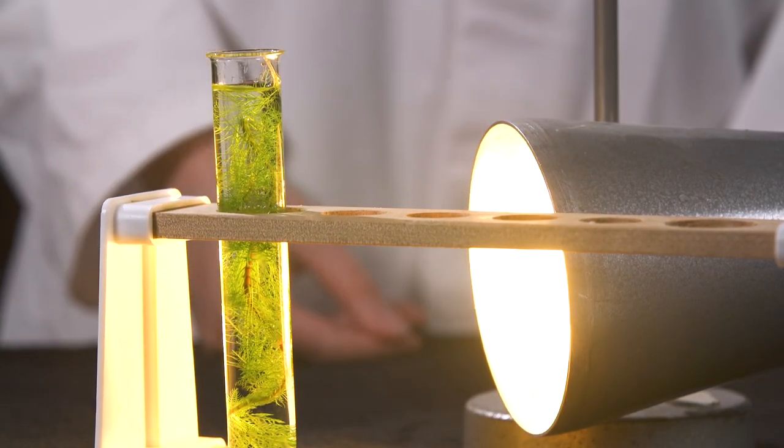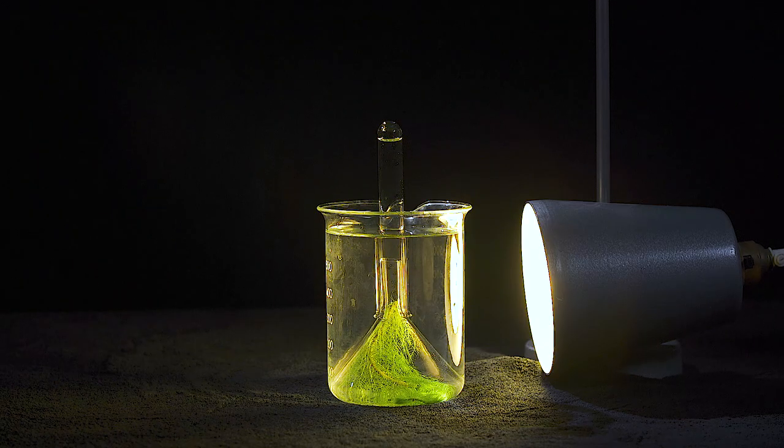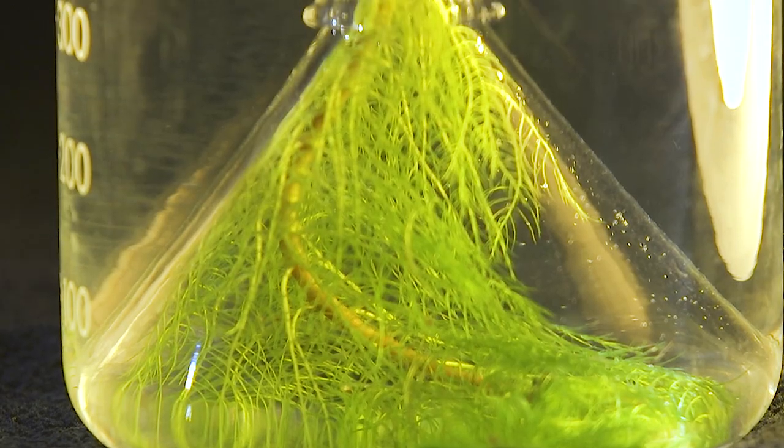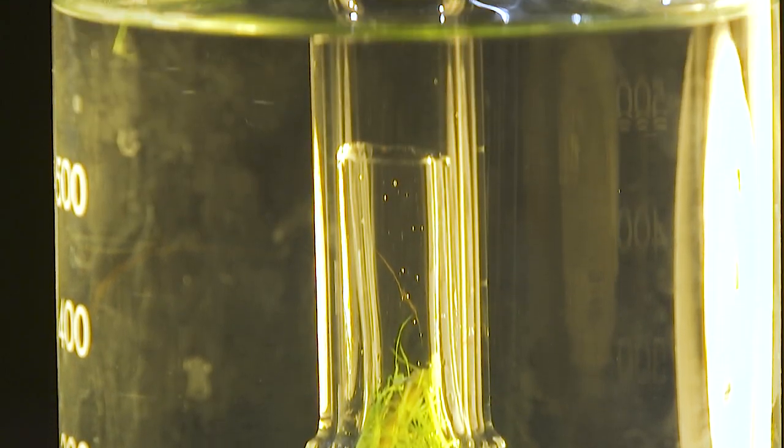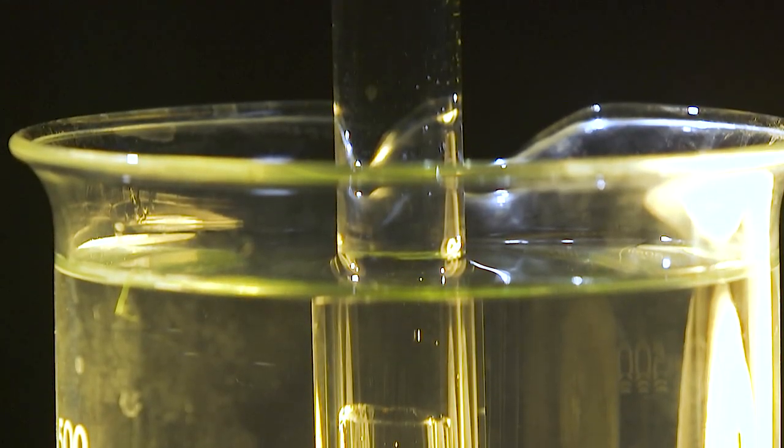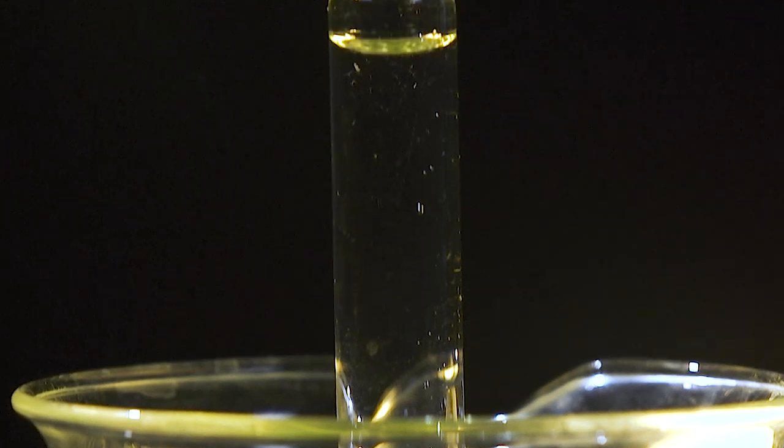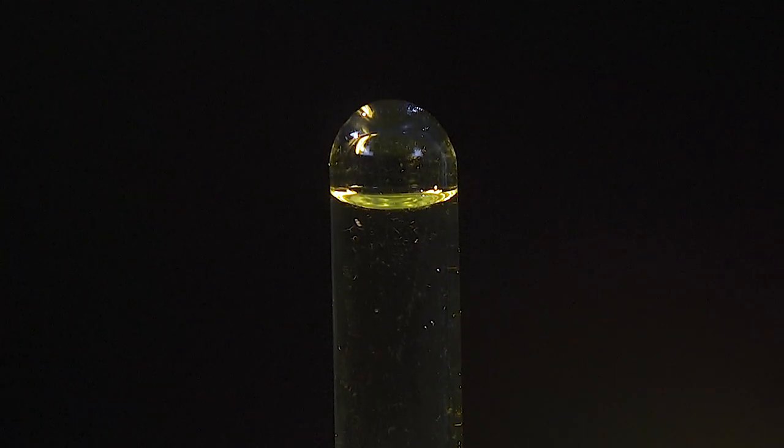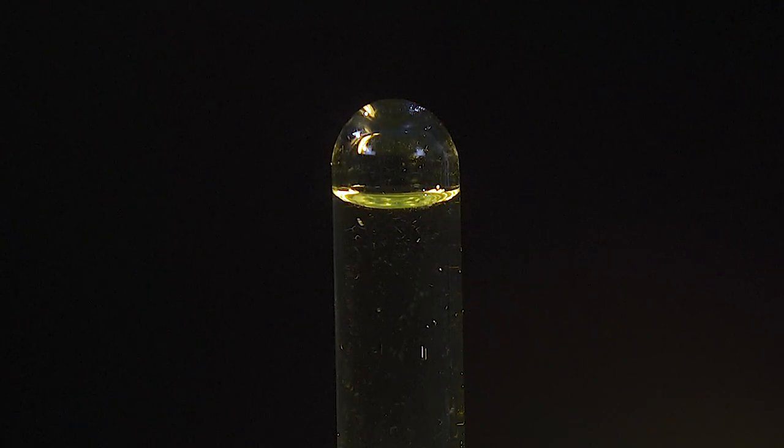As shown earlier, pondweed can also be placed in a beaker under an upturned funnel with a test tube over the top, so that the bubbles produced move up the neck of the funnel and displace the liquid in the test tube. You need to use a glass funnel for this setup because students will not be able to see the bubbles through a plastic funnel.